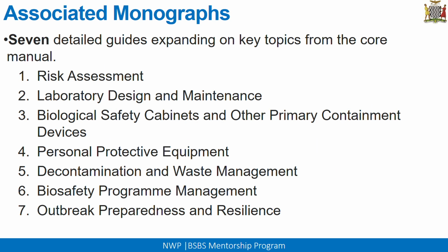So basically that's that on the Laboratory Biosafety Manual. So of course it was created by WHO, but in addition, WHO also released some monographs. So there are some sections in this Laboratory Biosafety Manual that have been explained in brief, but some of them have been amplified using the associated monographs.